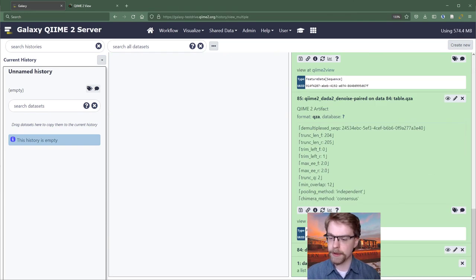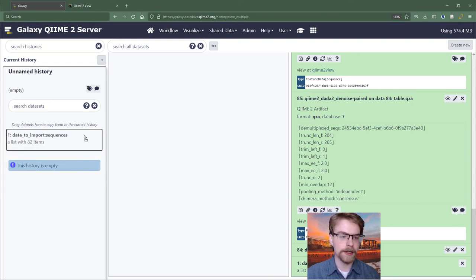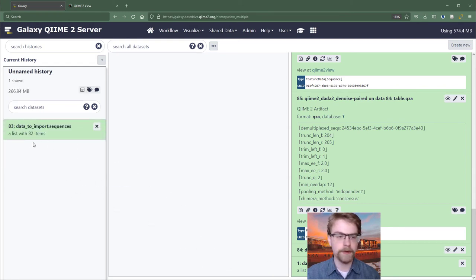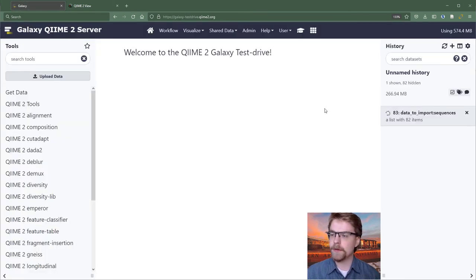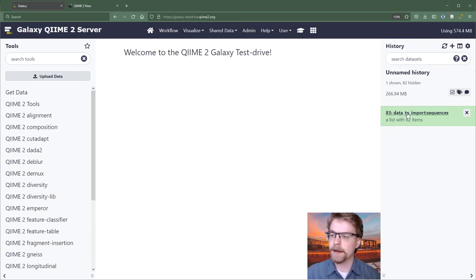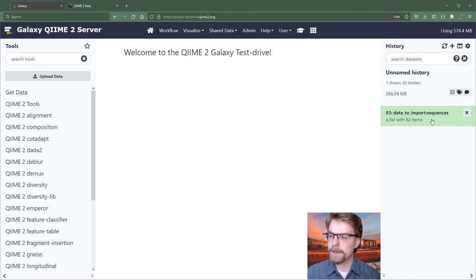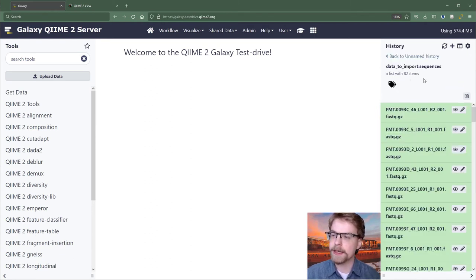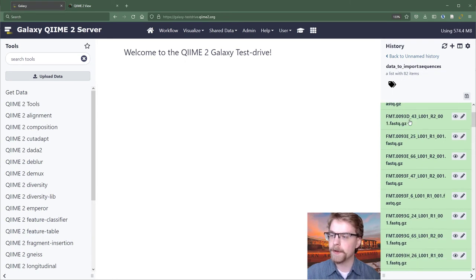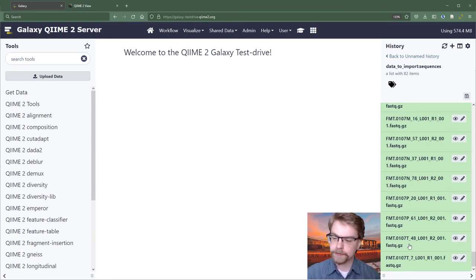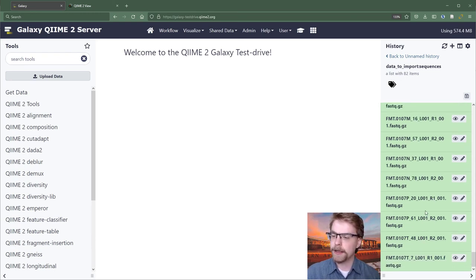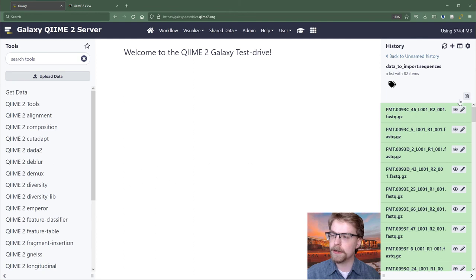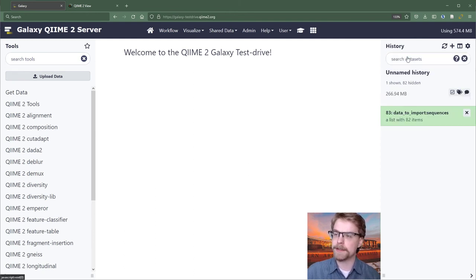One more important thing with histories is collections. I'm just going to move that over there so we can look at it. So what a collection is, is kind of like a mini history where this entry is a list with 82 items in it. If I expand it, it doesn't actually expand like the others. Instead, it takes us to a subhistory. And so here we see all of these files. And so this is data we'll be working with in the tutorial. But it's important to know how to enter a collection and also how to leave it. And so we would just hit back to unnamed history. And so now we're back out.